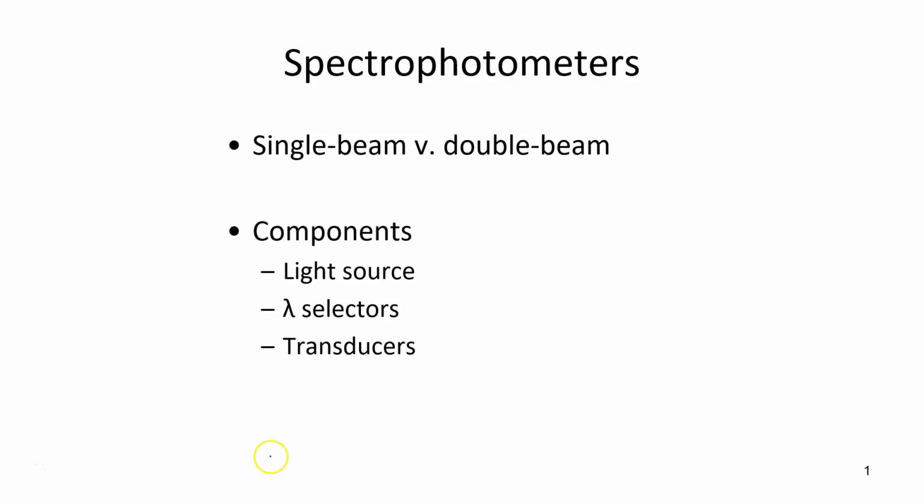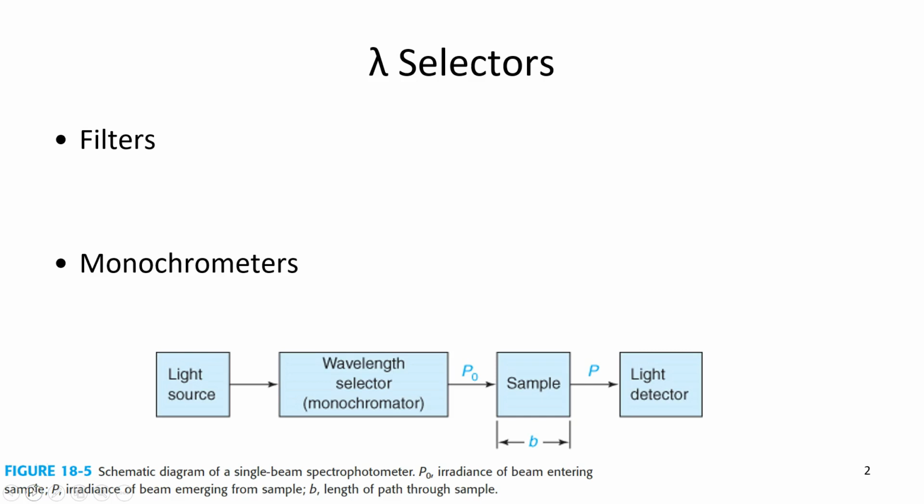Hi everyone, we're going to talk about wavelength selectors in this video. And just as a reminder, here is where the wavelength selector belongs in a single beam instrument.